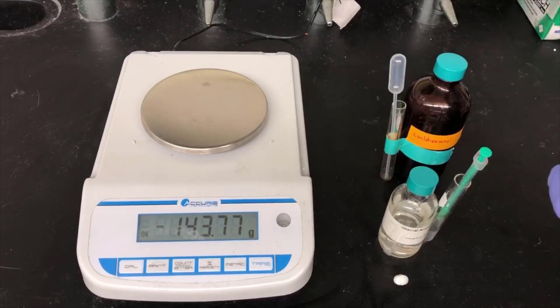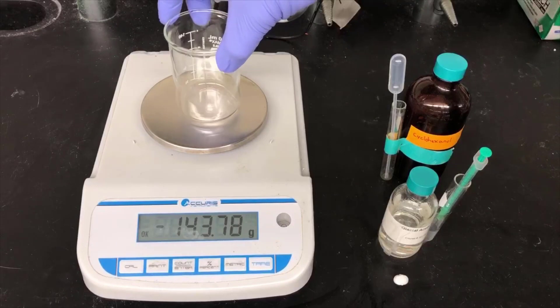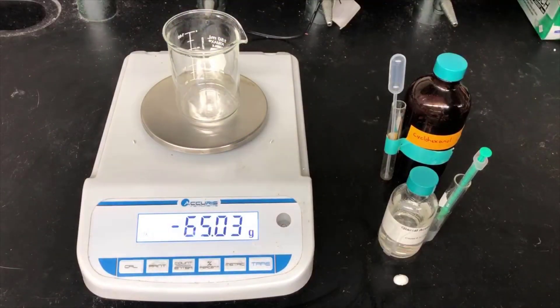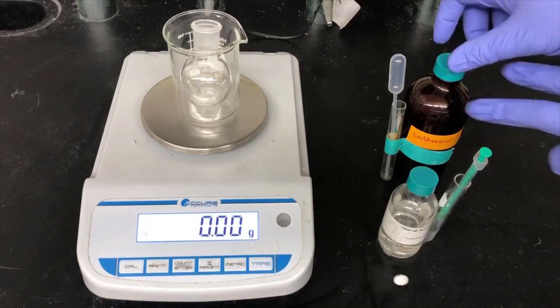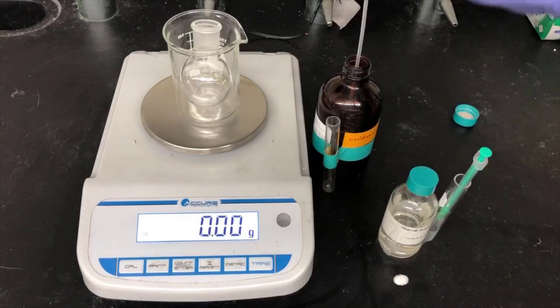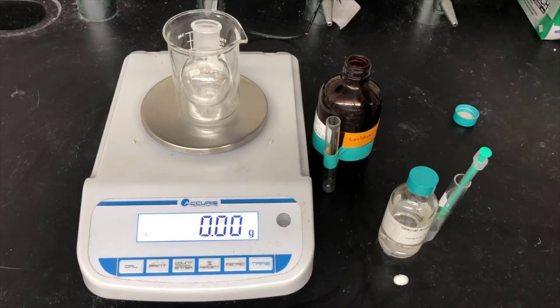We'll start the experiment by weighing out 1.50 grams of cyclohexanol. Get a beaker and a 50 milliliter round bottom flask, put them on the balance, and zero the balance. Then I'll pipette in cyclohexanol until I hit the 1.50 mark.